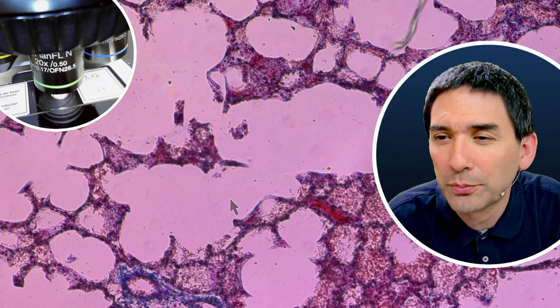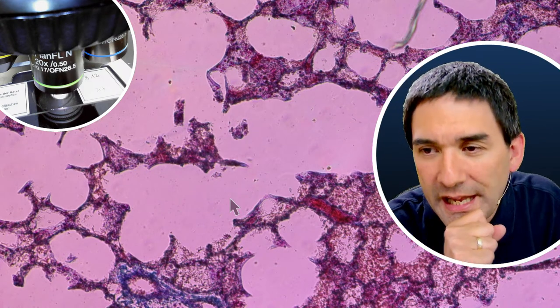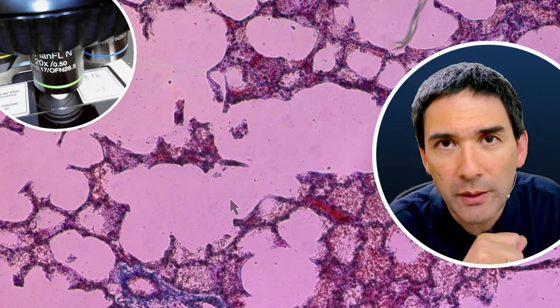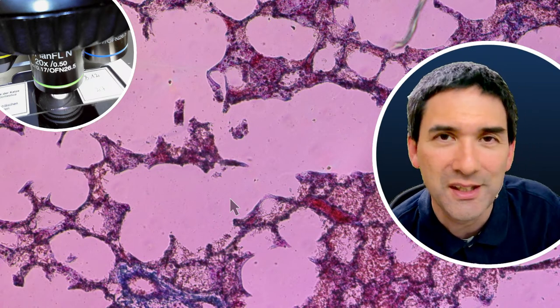Would I be able to prepare a slide from the pig bone left over from dinner? If you're somehow able to cut it very thin or to polish it down very thinly, then yes. Otherwise, I recommend that you look at it using a stereo microscope, but then I think you still won't be able to see the individual cells.